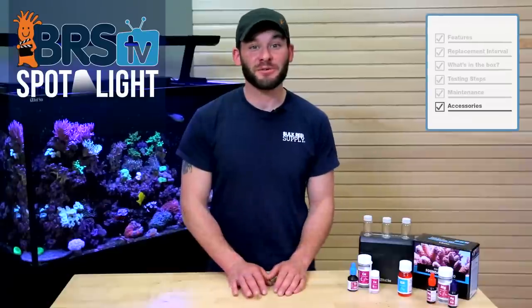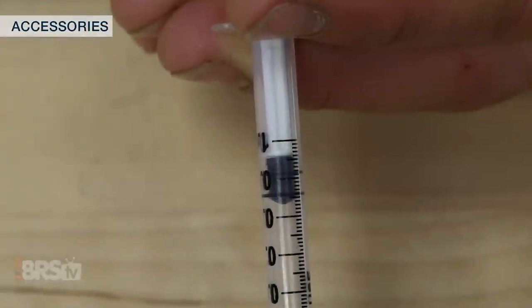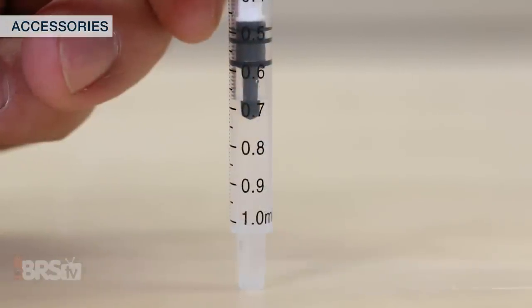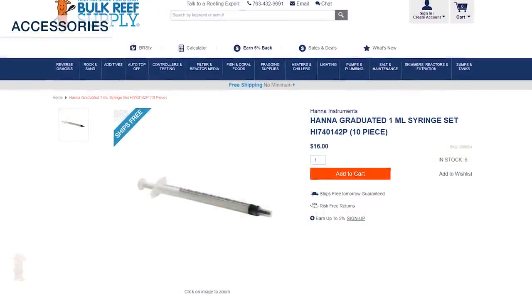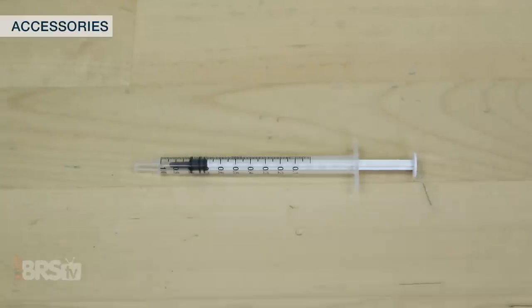There isn't much to accessorize the Red Sea Foundation Pro multi-test kit with. However, if you have some difficulty reading the plunger and converting the endpoint, there are other one-mil syringes out there that have reversed graduations, which tell you how much you used instead of how much you have left. Right now, these ones from Hannah are available in packs of 10, but I wouldn't be surprised if we see these individually in the future.